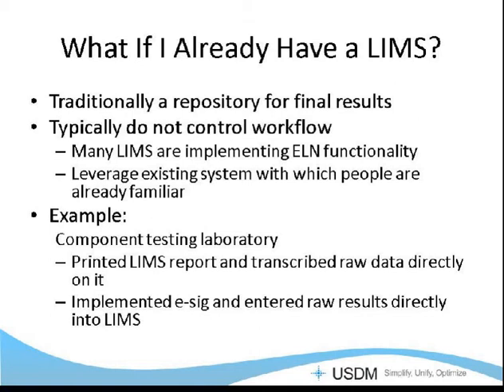We put workstations around where their instruments are so they can have the computer there and LIMS open while they're doing their experiment, and they entered it directly into the LIMS system, so saving the extra transcription and the review. This is a simple instance, but there are a lot of cases where you can leverage your LIMS system more fully than it probably is being done right now.